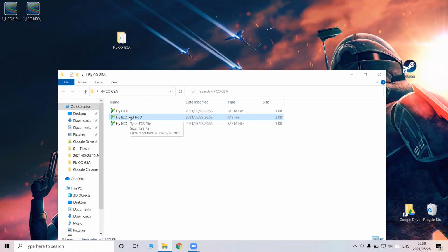Since it is the reverse sequence, it is on the bottom strand of our PCR product, which means it is the complement of the forward sequence. So we need to get the complement of the complement so they are both in the correct orientation and direction. We do this by using a software known as Mega.